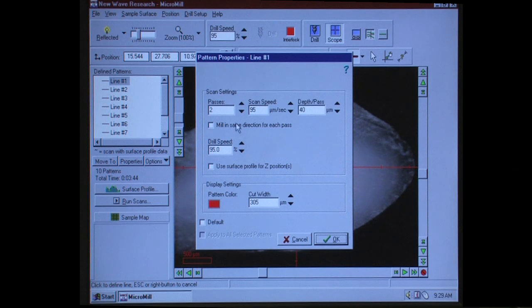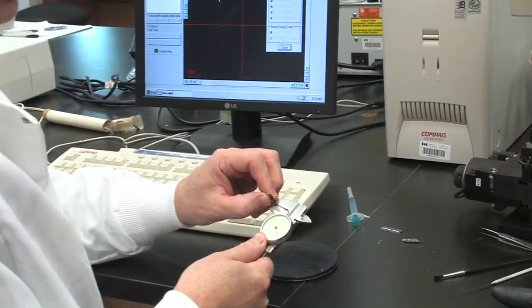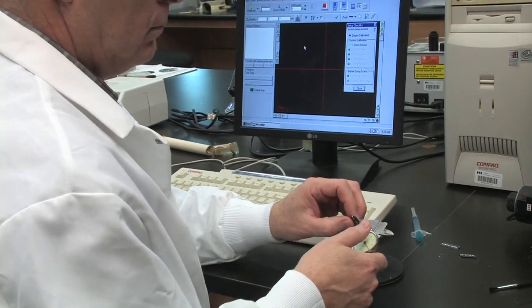Passes, the number of passes the drill will make through the sample. This number varies with the thickness of the sample, but most samples are one millimeter thick. You will need to divide the thickness of the sample by the depth of each pass to get how many passes you'll need to make to cut through the otolith section. It is important to use the thickness you measured with the calipers at the start and not the measurement the drill took.